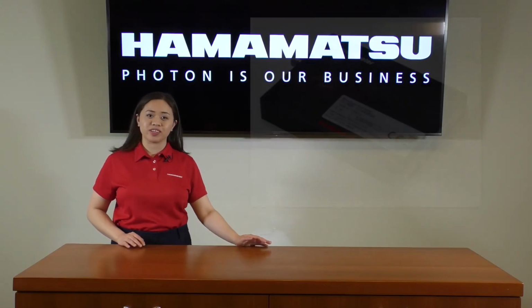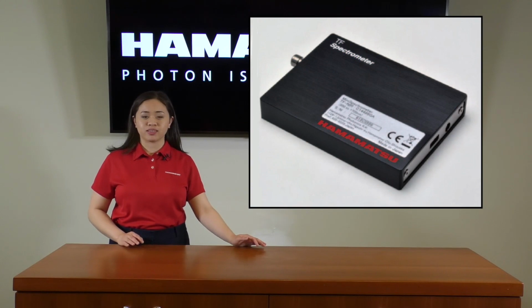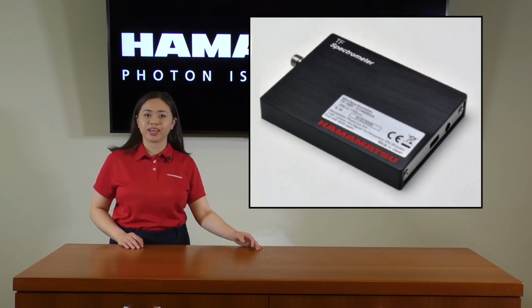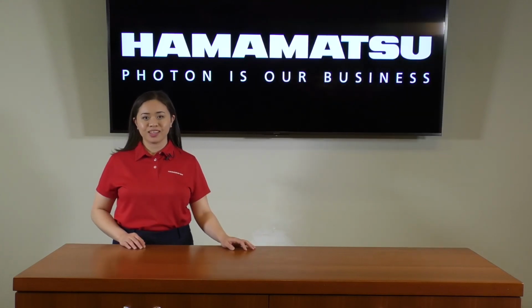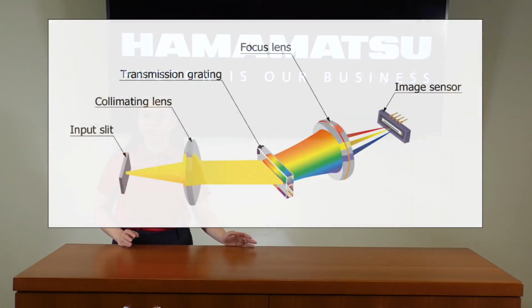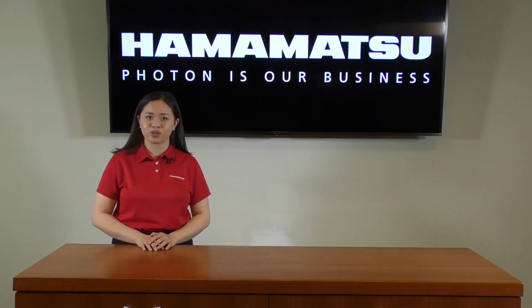The last spectrometer tested is our thin, flat Mini-Spectrometer. This device utilizes a grating optimized for transmitting NIR light and an InGaAs image sensor to collect this light. In this instance, broadband input light is separated through the grating into its respective wavelengths before being focused onto the active area of the image sensor.